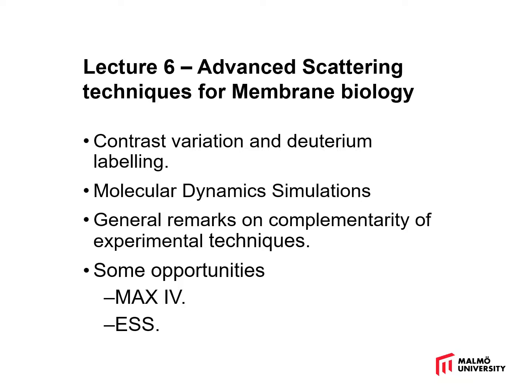While I'm on the theme of complementarity, I think it's also worthwhile to give some thoughts on complementary experimental techniques. Quite often, some information is missing from a scattering curve, or when you come to do the modelling of a scattering curve, and I think this is an important aspect to touch on during these webinars. And finally, the really important opportunities facing students and researchers in Sweden and more broadly in Europe, that is the MAX IV synchrotron and the ESS. I think this is an exciting time to be a scattering scientist.